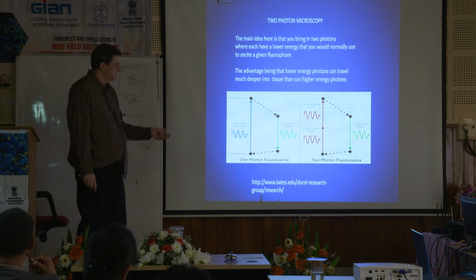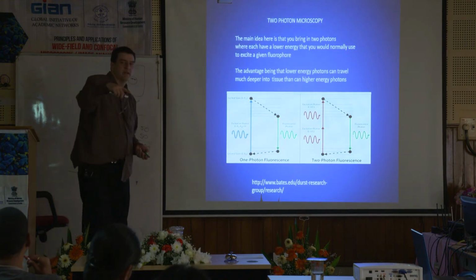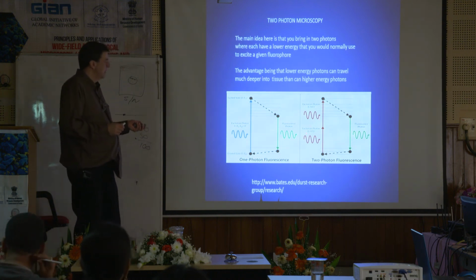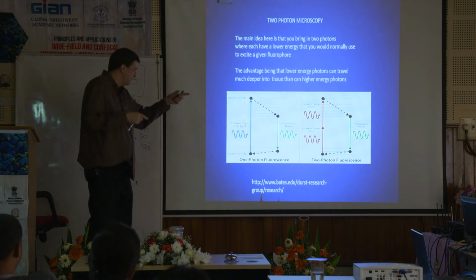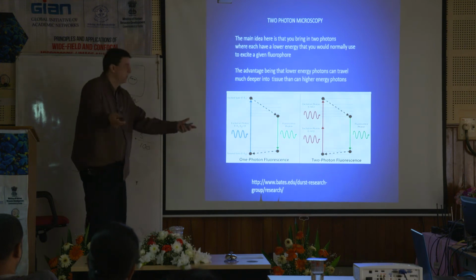Now, you used to use this, Shrejith, right, with Dr. Wong's lab, I think? Okay. You did it intravitreal, so, okay. But the same idea. So they're out there, they're pretty cool, they're really expensive because the lasers are special lasers. They have to be able to throw 2 photons at the exact same instant for this to work. You can't have one come in 50% and then one come in 50%. They have to both come in. 2-photon.